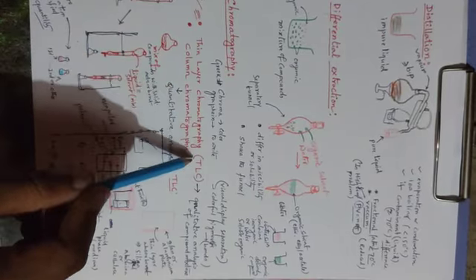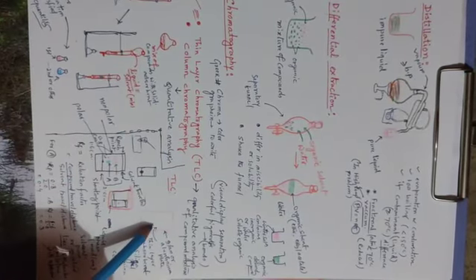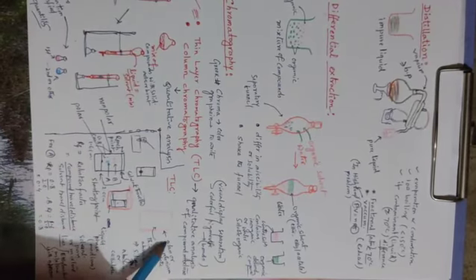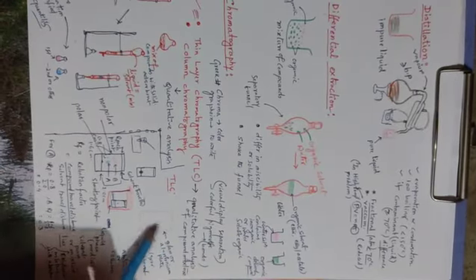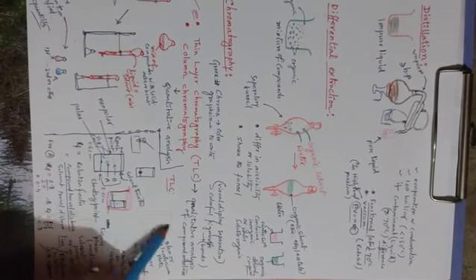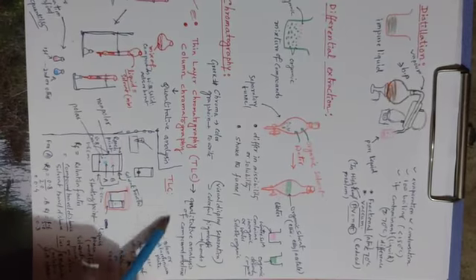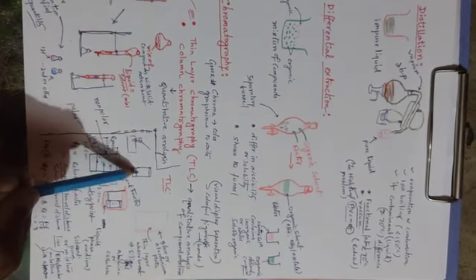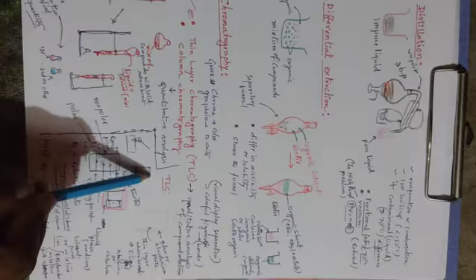Let's first come to the TLC, or thin layer chromatography. So this is the TLC, where this is one plate, a glass or aluminum plate, and above that some adsorbent like silica gel, alumina, or cellulose is put here. So this is how a TLC looks. We just give a mark here, the base mark, and this is the upper mark.